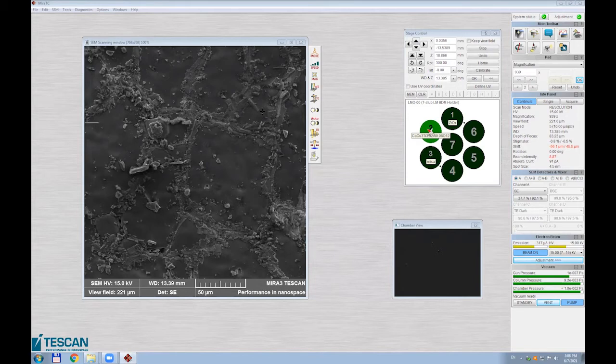I was just saying that you have to take it not as a very fixed, very precise number, just to have an idea that you have 50% of titanium there and so on. And then I was showing you that we can take an object, and if you would like to know where is what, you can acquire a map. Again, it's very fast. So you're acquiring your picture here.